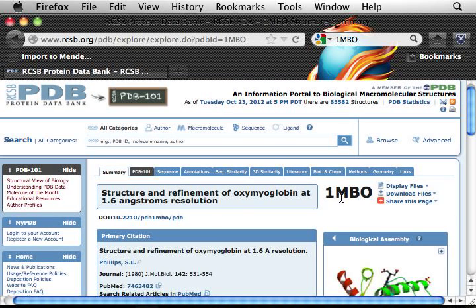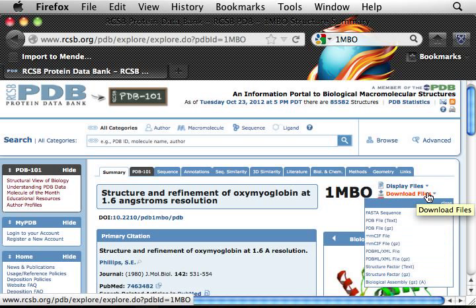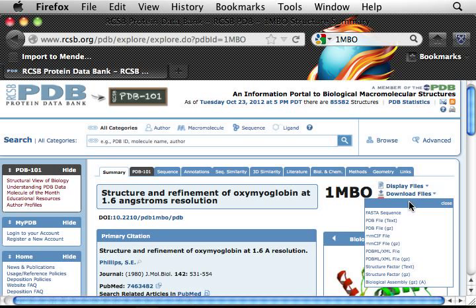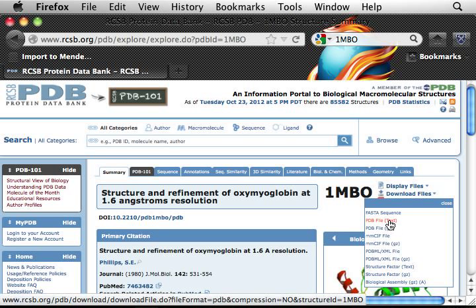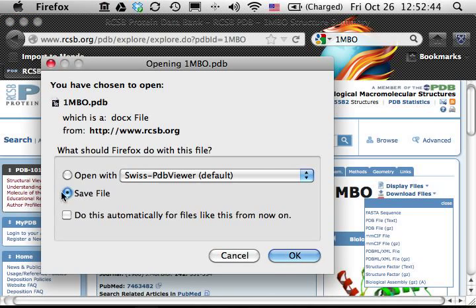This is the structure for oxidized myoglobin at 1.6 angstroms. To download the PDB file, go to the download files dropdown menu, select PDB file text, and save the file.